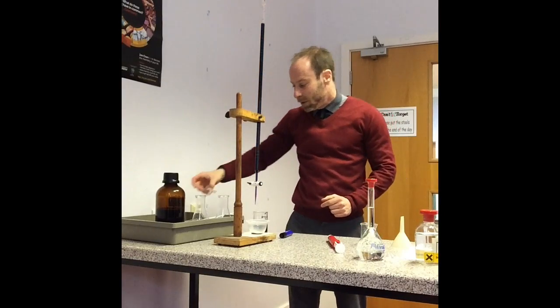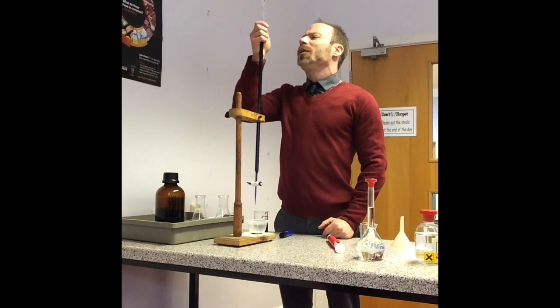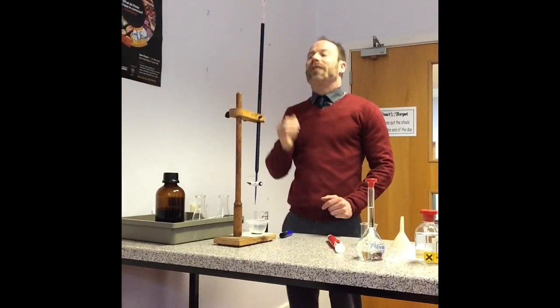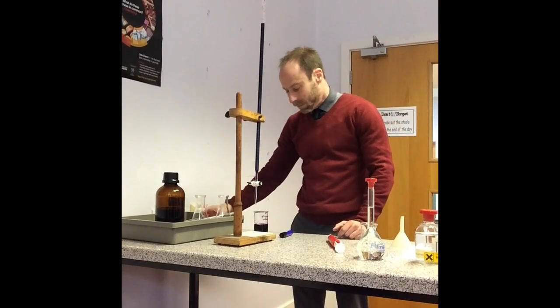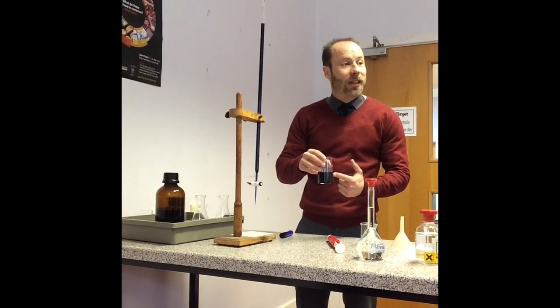Right, so I will remove that there. My reading is quite difficult. You can't really see the bottom of the meniscus, but the reading there, if you can make a note, my initial titre is 3.80 centimetres cubed. You want to avoid spilling this on yourself as well.